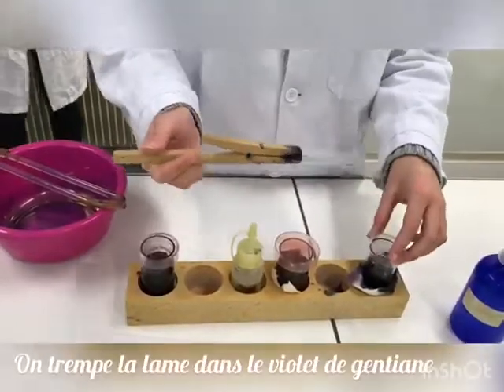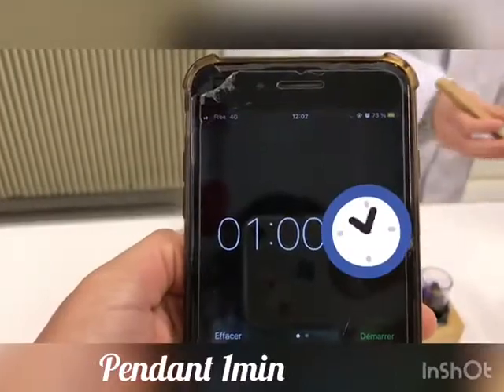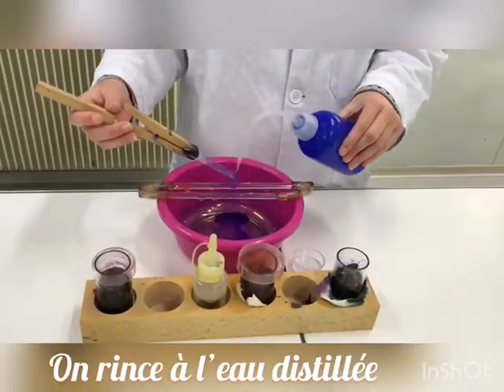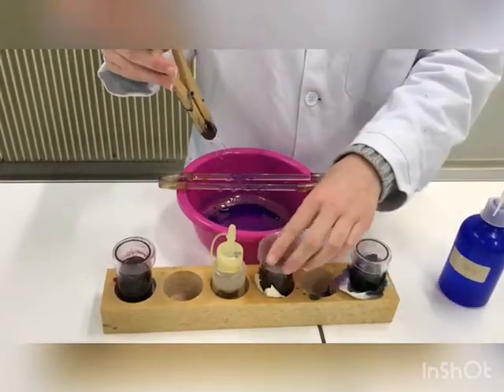We begin the Gram staining with the first dye, which is crystal violet. We put the slide in this first dye for one minute, rinse with distilled water, and then put the slide in iodine for one minute.